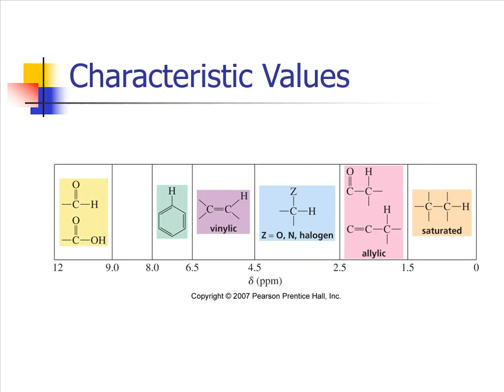So here is basically an NMR spectra. What I want you to keep in mind is that this is pretending like this is the y-axis of the spectra. And of course, this on the bottom, if I can draw a straight line, and I can't, is the x-axis. And this is the x-axis in terms of parts per million.